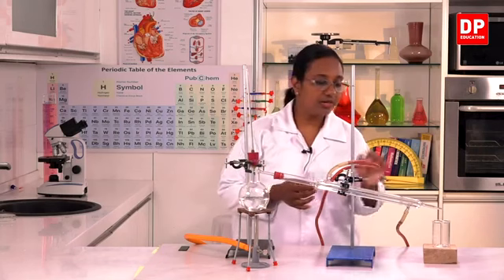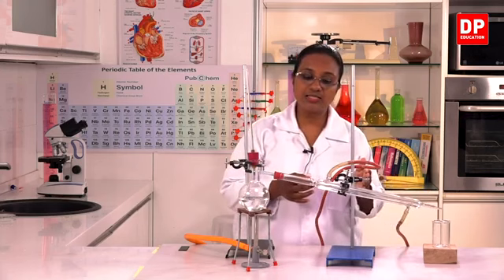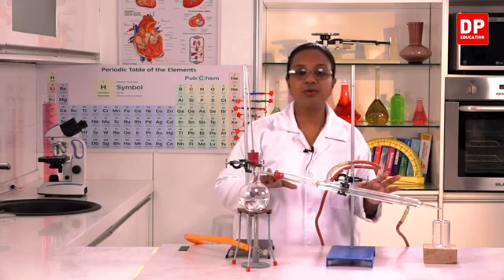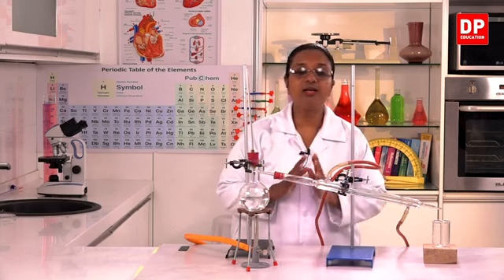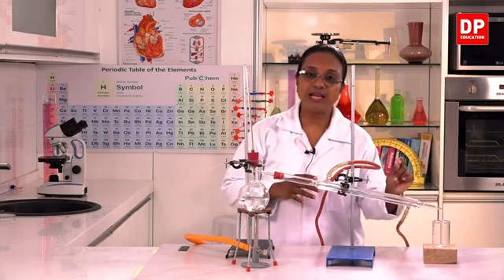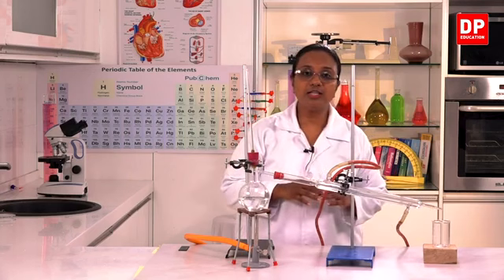So what we do is we send the water from the bottom so that water fills the whole condenser and flows out through the top opening. So that throughout the process there is enough water flowing through the condenser. The vapor can condense very easily, and the condensed vapor, that is the water here, will come out from this end, and we will collect the water here.